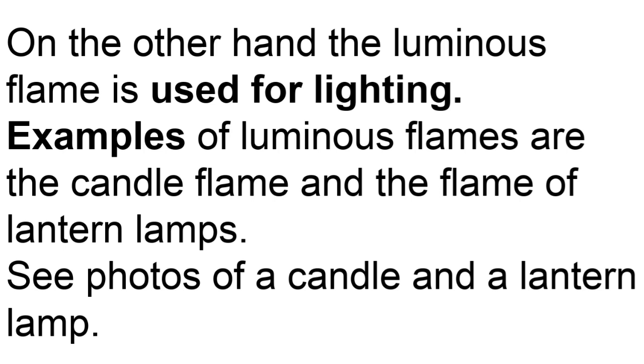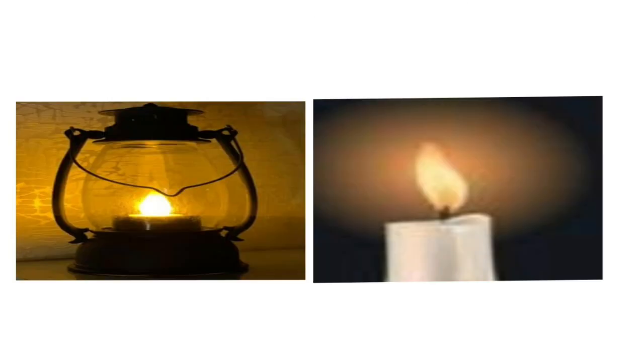So, we conclude that the non-luminous flame is preferred for heating in the laboratory because of 2 reasons. Number 1, it is hotter, and number 2, it does not produce soot. Now see some photos of a candle and a lantern lamp below, showing how the luminous flame produced by the two is used to light a place because they produce a lot of light.